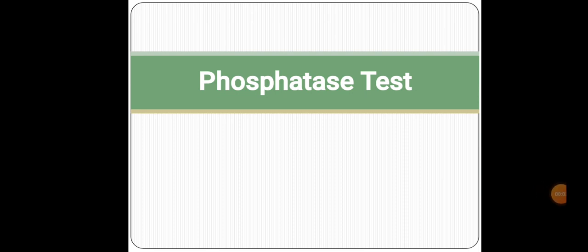In this video lecture, we will discuss the phosphatase test. Why is this test used here? This test is used to check the quality of pasteurized milk. Pasteurized milk is safe for human consumption. We can consume it safely, as it kills the bacteria.